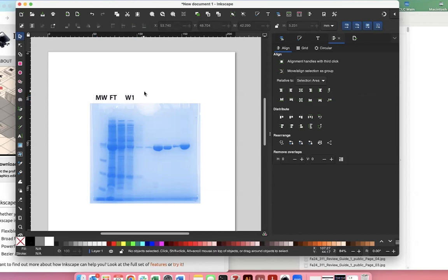But now we want to make it so that they're more evenly spaced. So remember that you can press Control to limit the movement. Before we were using Control to limit the squishiness, we can also press Control to limit how it can shift, so that we're not zooming all over the place and we're keeping things in line.